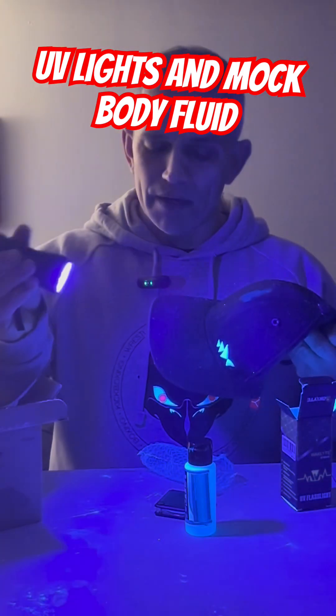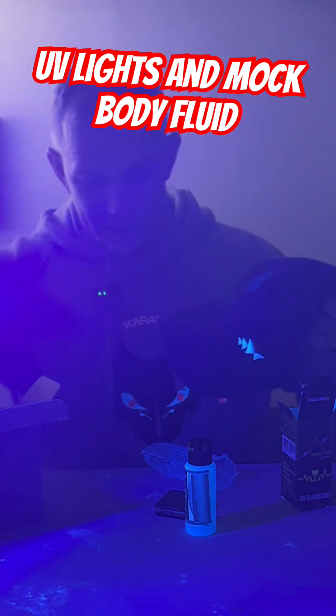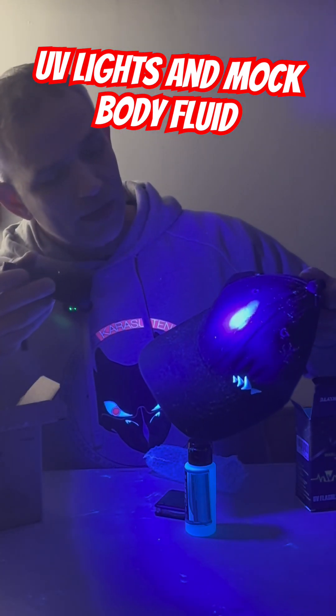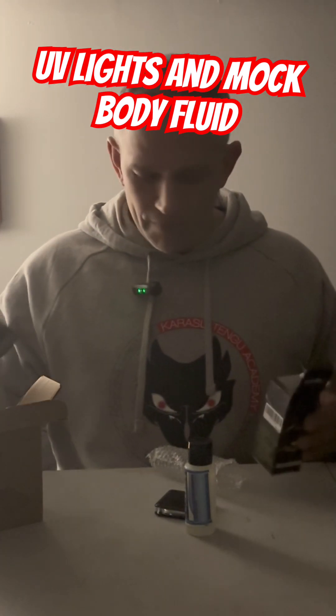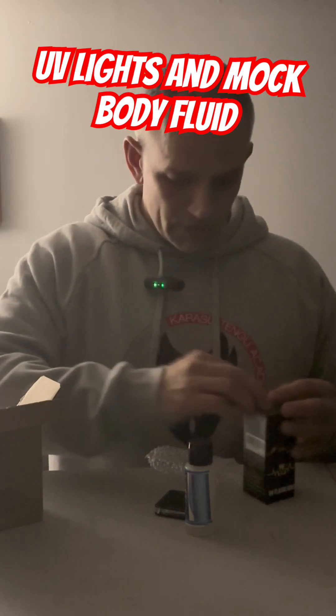Here's the one that was a little more expensive. You can see it's giving off a lot more. You can see the table — I have the powder all over. And look at that light here. This one was inexpensive as well, but it's only one, so if you had a lot of people you'd want the others. You can see that the UV light works really, really well.